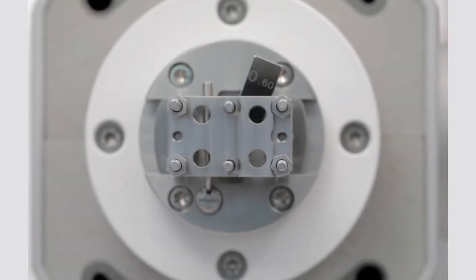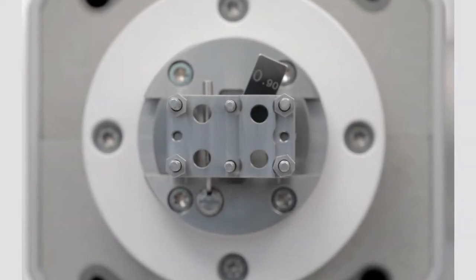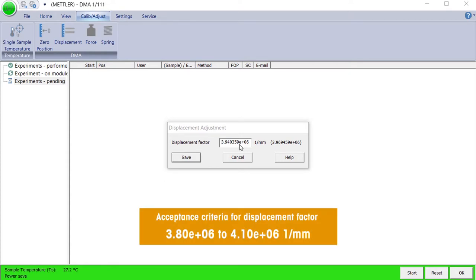Repeat the procedure for the other two gauge blocks as described for the first. After the third adjustment is finished, the dialog box Displacement Adjustment, with the newly calculated displacement factor, pops up in the module control window of STAR-E software. Check that the new displacement is within the limits and press Save.